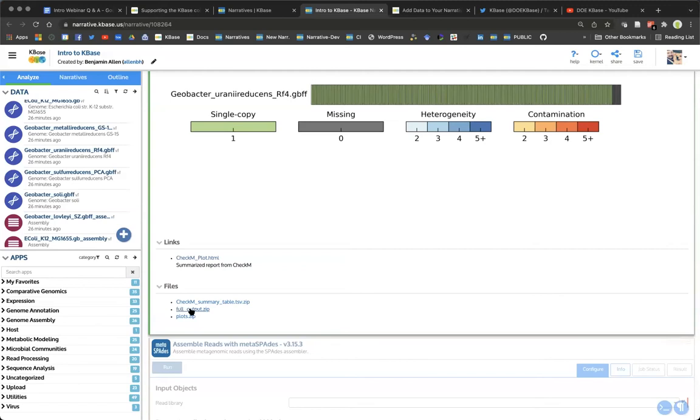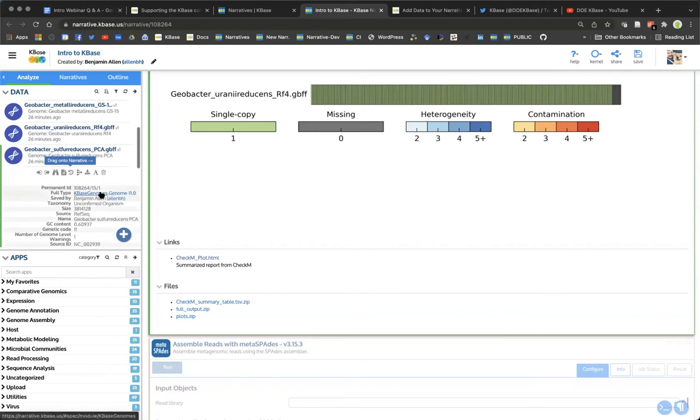So this is an important thing to understand with KBase, is that not all file types become data types in KBase. Any data that we pull into the system, we convert to data types and data type specifications that are specific to KBase. So for instance, you can see that this genome is the KBase genome type 11. And what this means is that effectively, we have interoperability of our apps against different types of data, different versions or different types of the same kind of data.